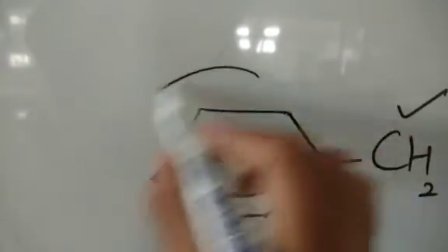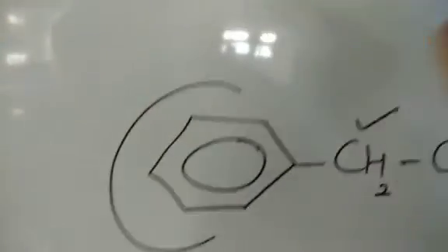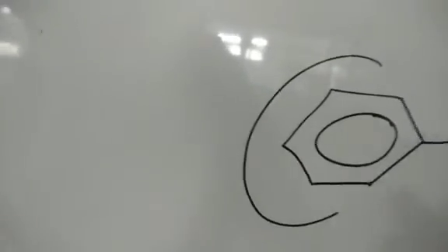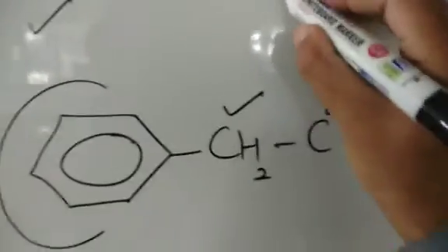There are 5 protons in the ring. Fine, 5 protons. अब यहाँ alkyl group है, जैसे मैंने अभी कहा था एग्जाम्पल है methyl group, the weak electron donating. Same is the case the alkyl group, it's a weak electron donating. तो इनका नेचर में ज्यादा फर्क नहीं पड़ेगा. तो all these 5 protons in the ring, that we have one type of protons. So we have 1, 2, and 3 signals in this type of compound.